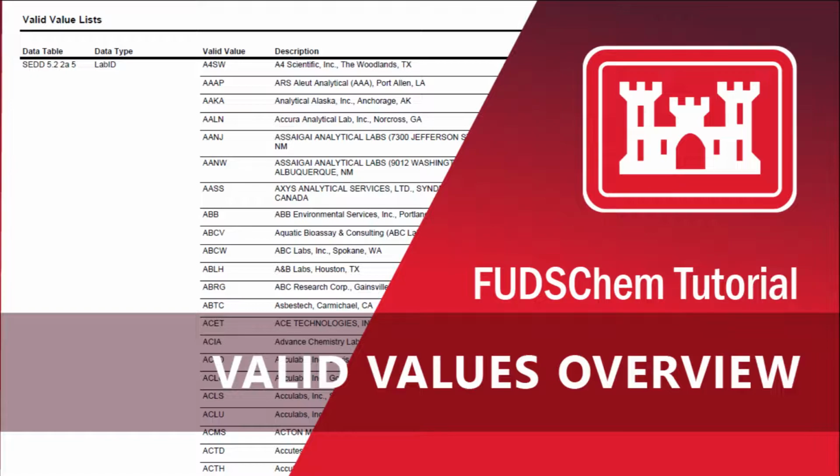They are used to standardize data entry, providing a common language for data users and generators. For example, instead of having each user type in the full name of a laboratory, having them choose the valid value that represents that laboratory avoids the possibility of inconsistent spellings or punctuation, typos, etc.